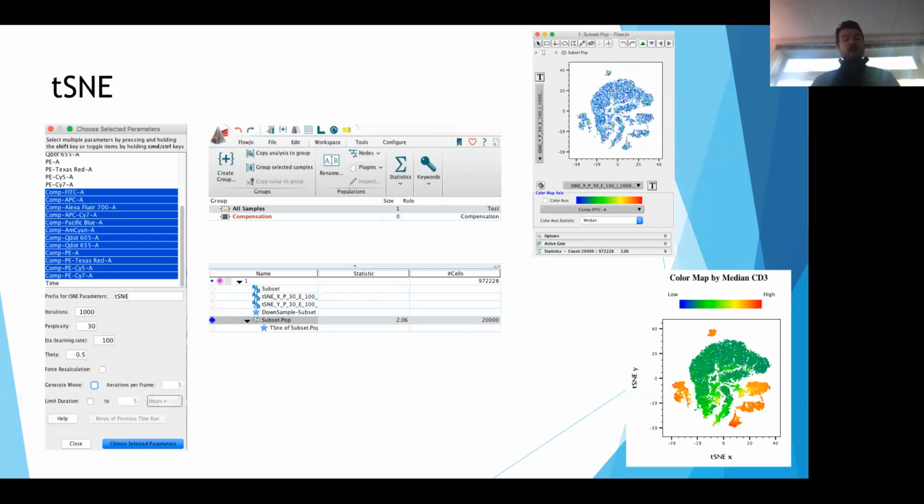I know this is a little bit of a complicated process and it's definitely multi-step. So feel free to write to either myself or to techsupport@flowjo.com and we can absolutely walk you through this process. It's very common. Lots of people are running tsne and so we get this question all the time. That's a really good question.